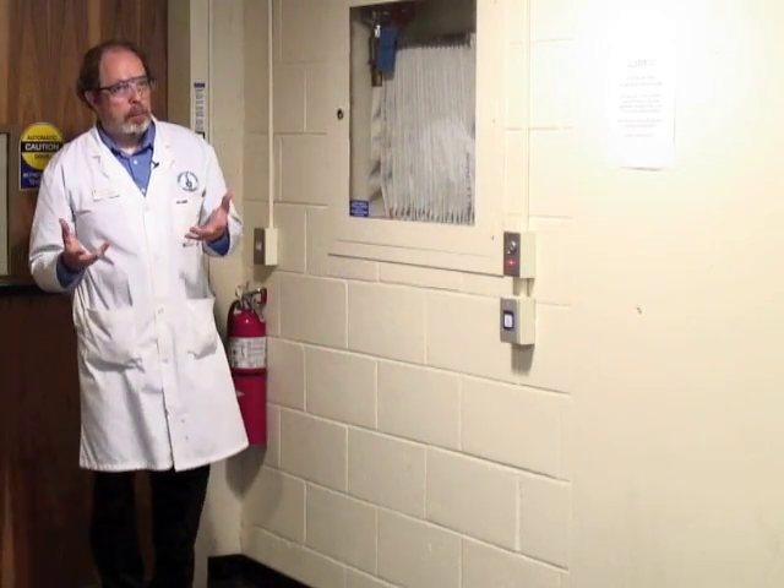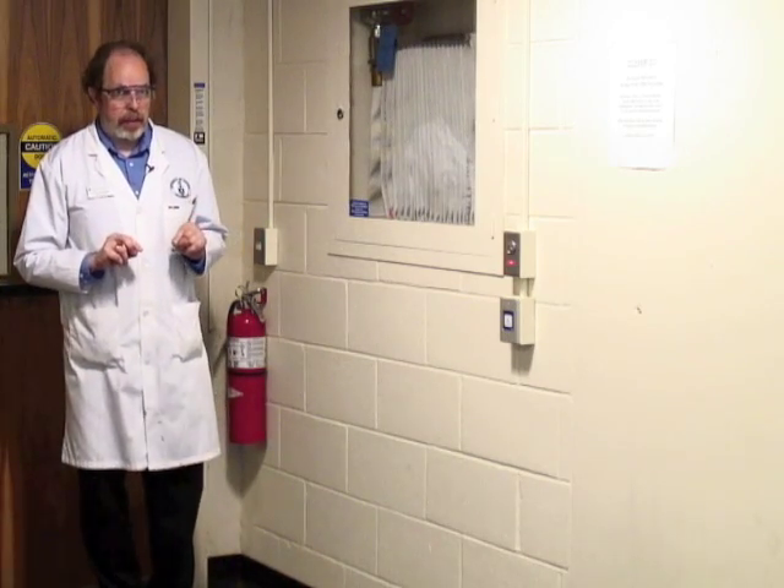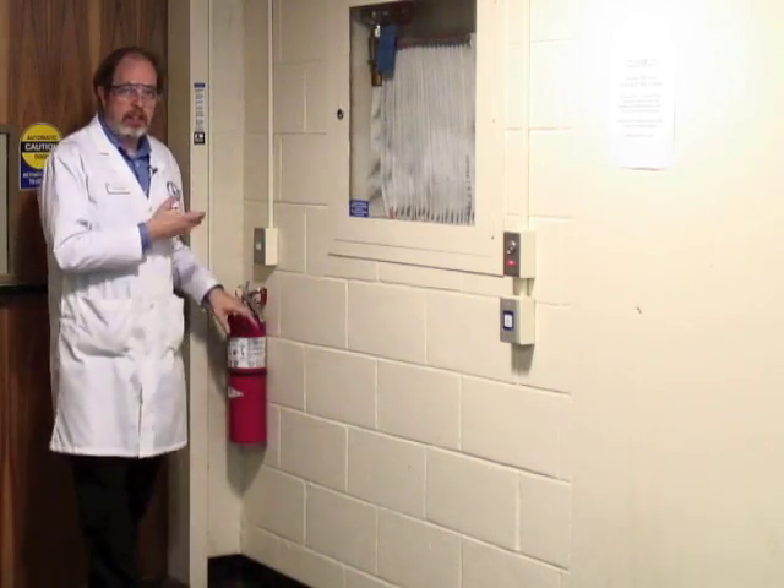If a fire starts and you are nearby, take the initiative and sound the alarm. Say 'fire' in a loud clear voice so that the people around you are alerted. If it's in a fume hood, close the door. If you feel comfortable, get a fire extinguisher; if not, get out of the way. If there is a fire on equipment, fire extinguishers are always next to the fire exits — you should know where the exits are.